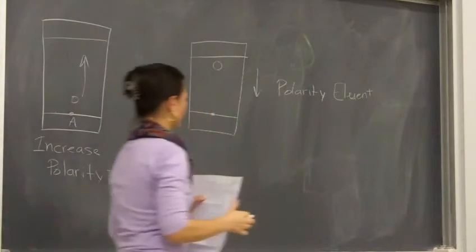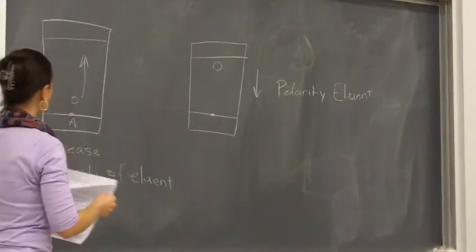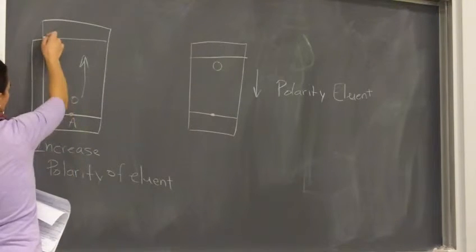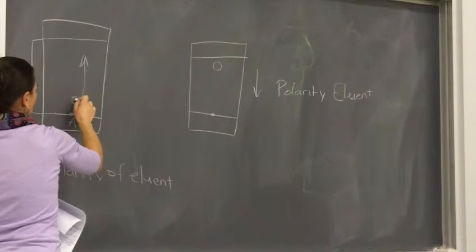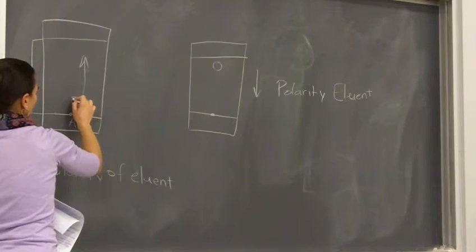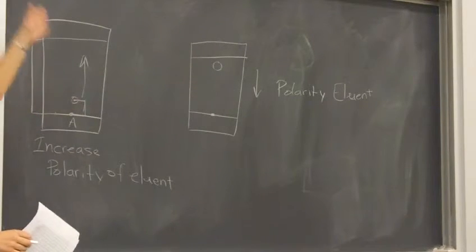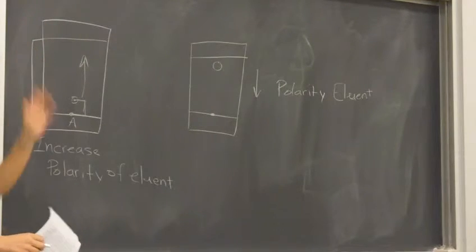Okay. Now I talked about not moving your jar around. So this is the distance from the origin to the solvent. So this is our bottom number. This would be the distance from the origin to our spot. It gets complicated if your spots didn't travel nice and vertically up your plate, because then it's hard to measure things and figure out what has happened, all right?